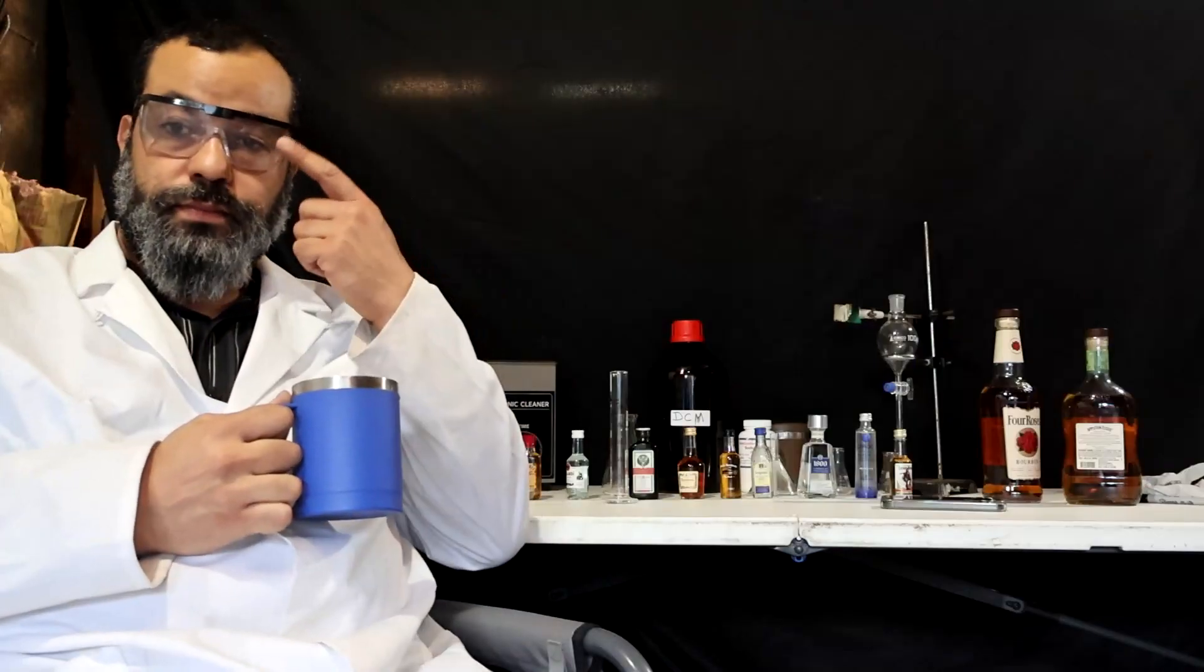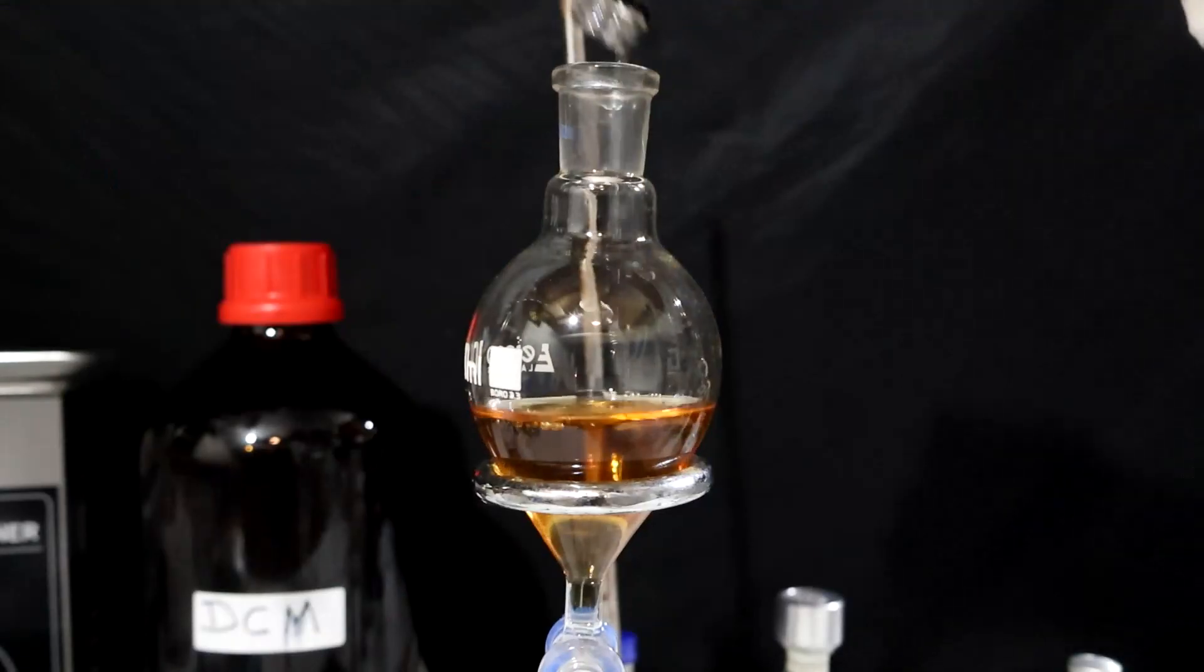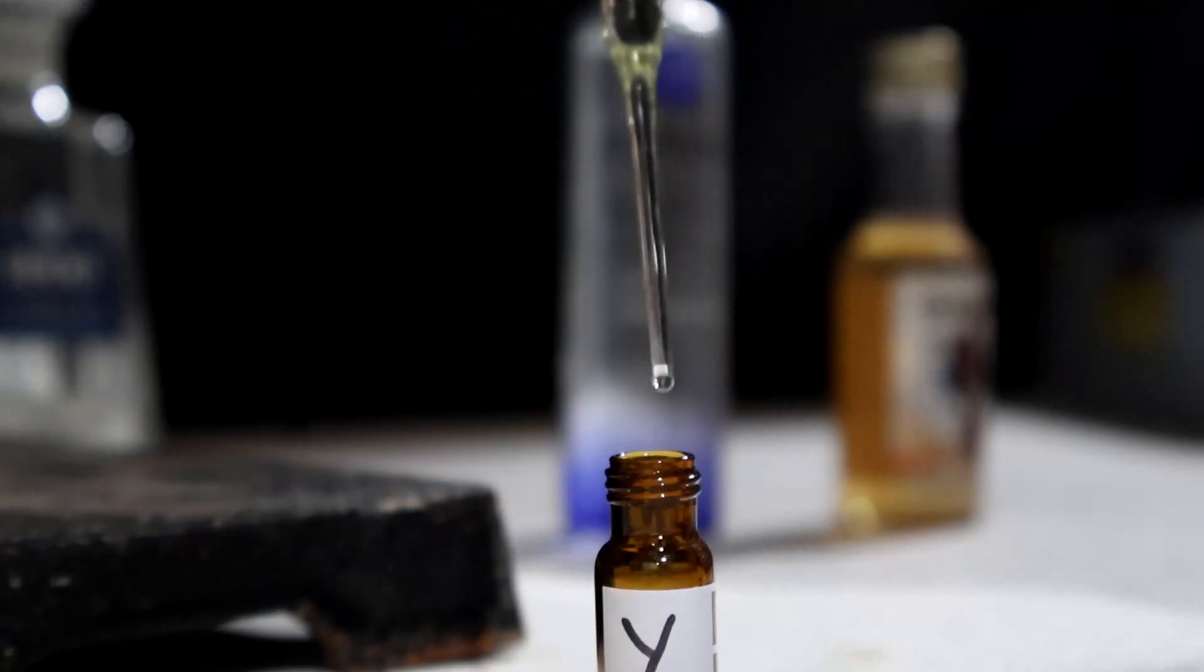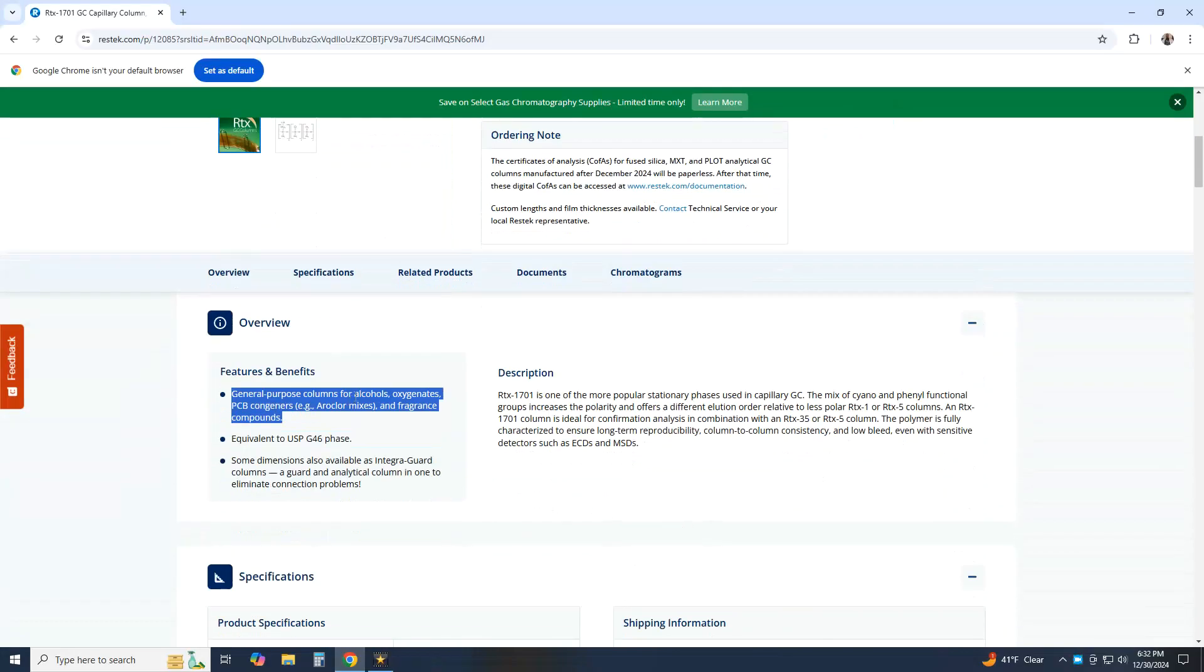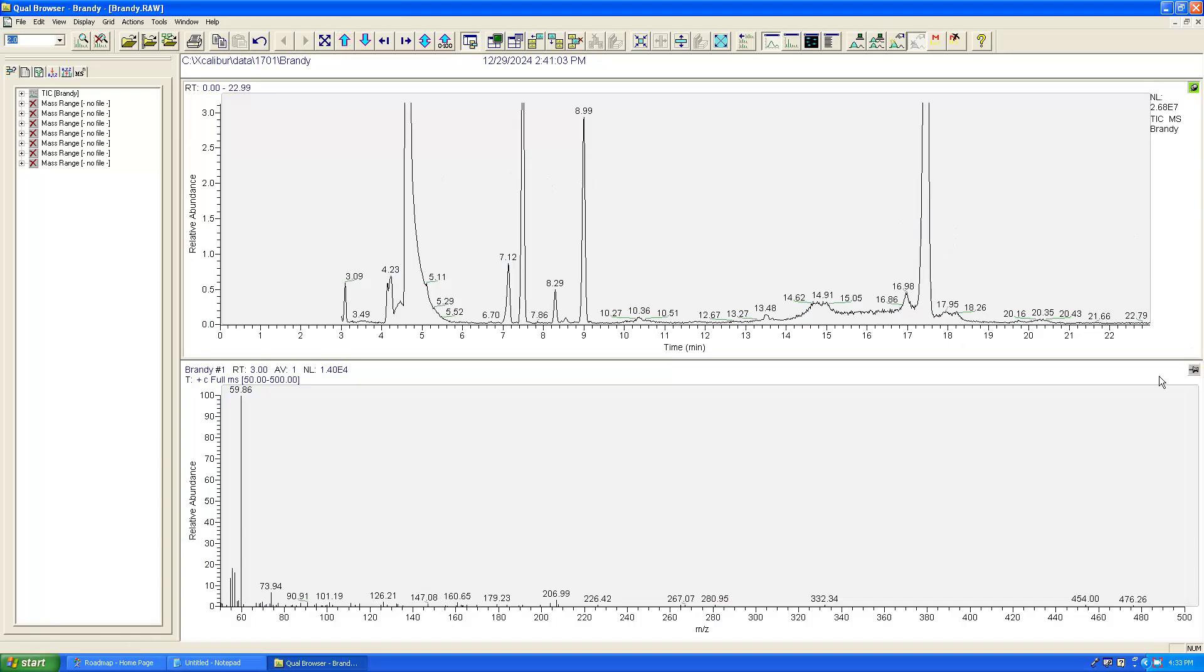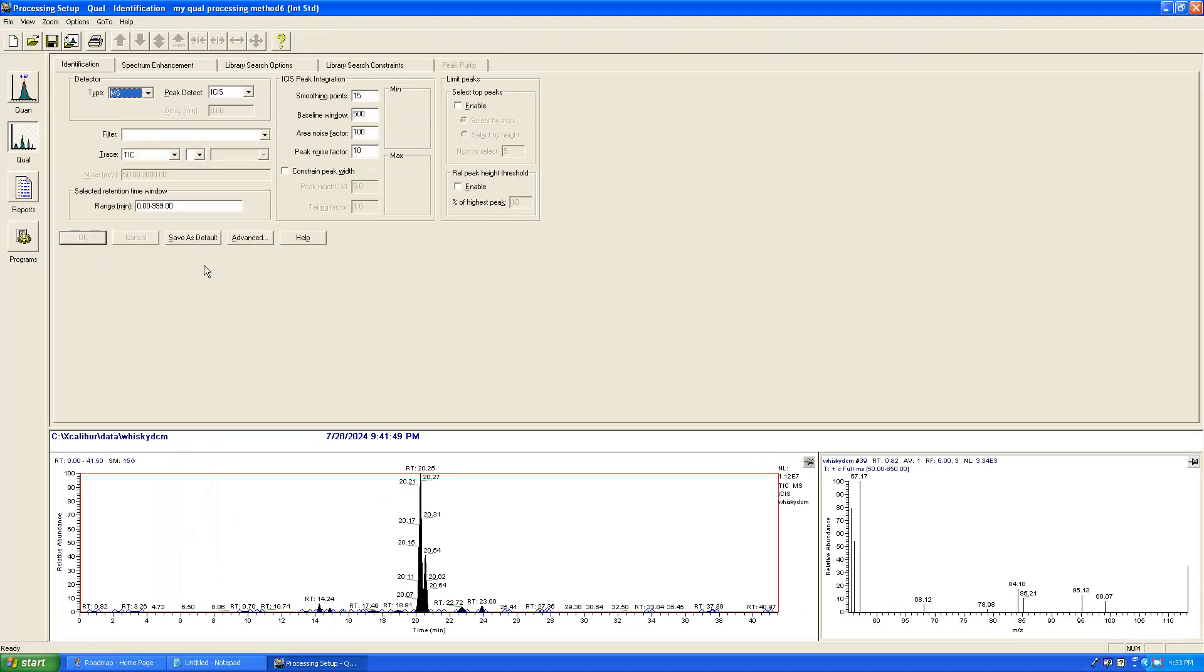The leftover concentrate is then stored in amber glass vials ready for injection. I'm using the 1701 Restek column specifically designed for alcohol, aldehyde, and organic acid. I tested it down to one part per billion for sensitivity and got acceptable results.